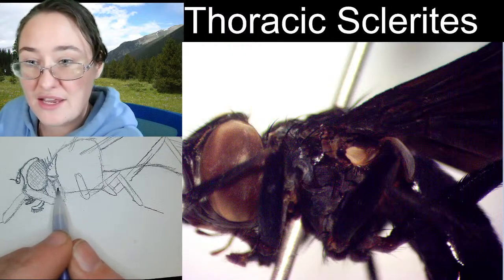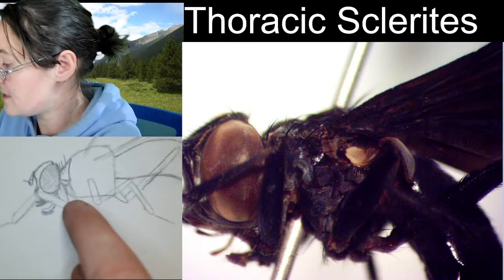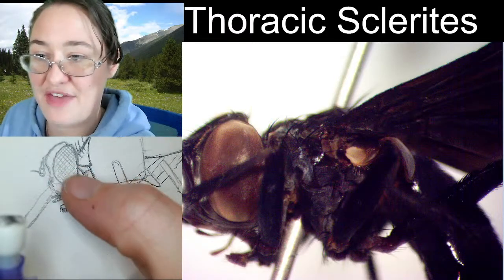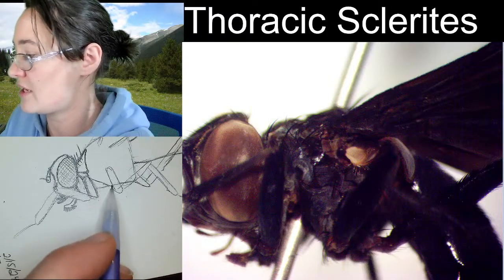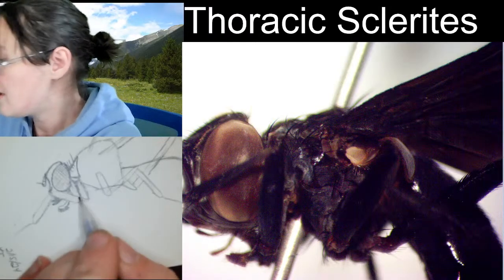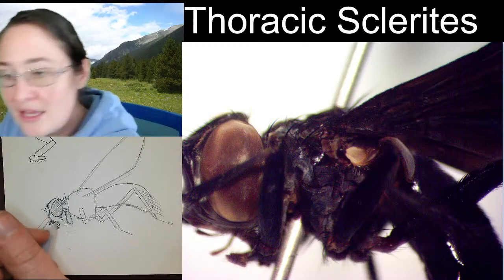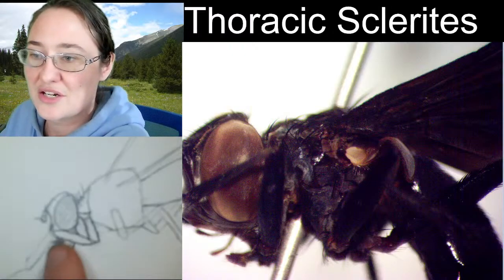So this right here is going to be the coxa, spelled C-O-X-A, and it's going to be coming down from our guy, and he's going to go right about here to the edge of that. So we've got that front leg coming down. It is going to be significantly separate from the middle leg, so we are going to bring this segment down more like this, separating that coxa from the rest of the body. The femur is coming up, and in this specimen, it's coming straight up so that it's overlapping the coxa, but I want it to move forward like this fly was standing, and so that is why my fly's femur is going right through his head.